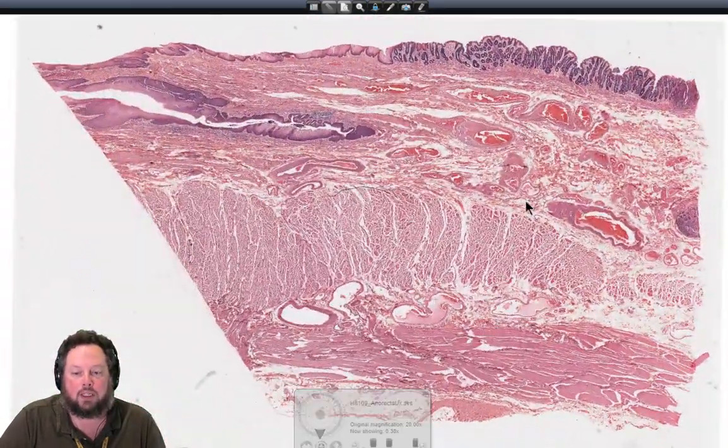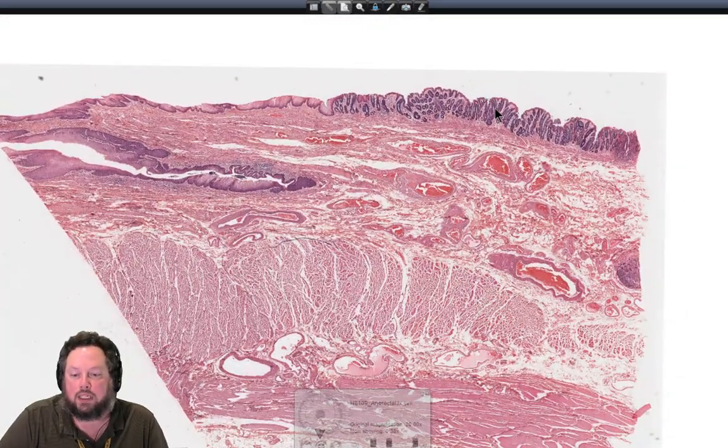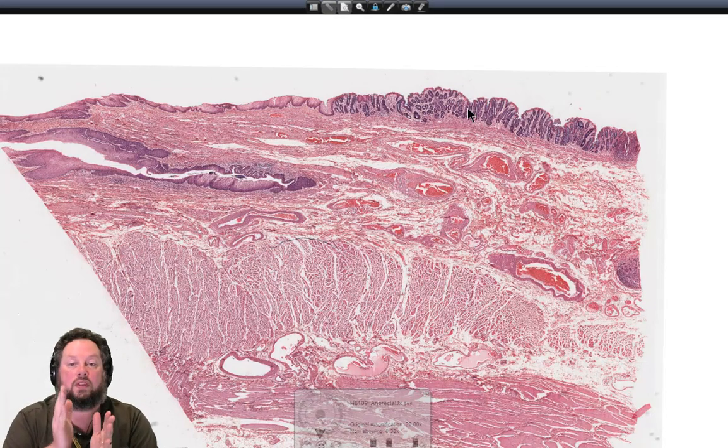Right. Okay, so this is a section of the ano-rectal junction. We've got the rectum here on the right-hand side, and we've got the anal canal on the left-hand side. There's, again, a little bit of folding here, so ignore this region here. Just follow the epithelium here. So again, what we're doing is we're moving from, this time, a simple columnar to a stratified squamous non-keratinized.